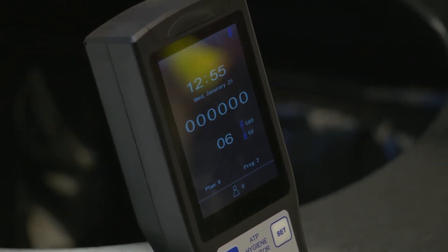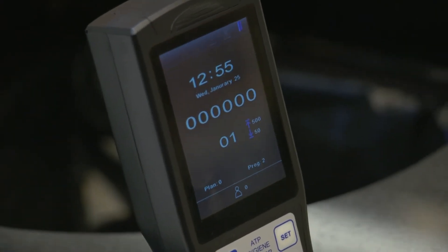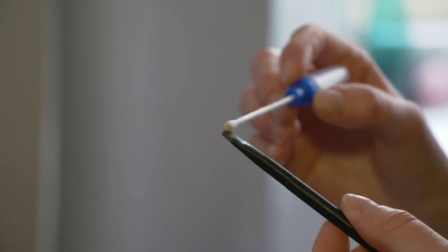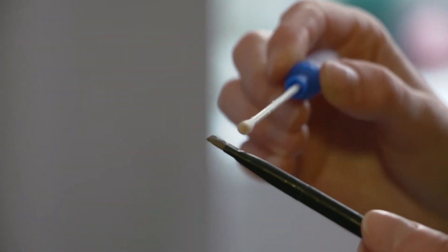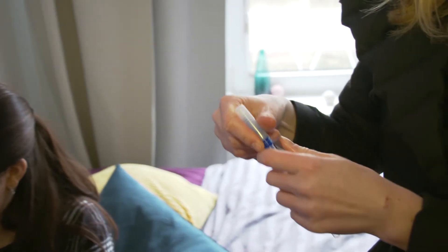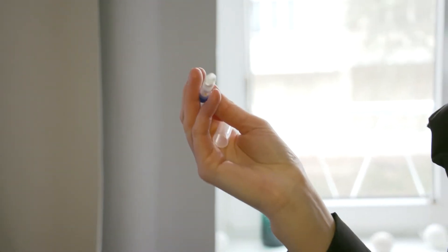Sterilization, sanitization. PCE ATP-1 is an ATP tester that can be used for cleanliness control and documentation in commercial kitchen food preparation, industrial food manufacturing and food processing, professional cleaning services, operating rooms, and more.